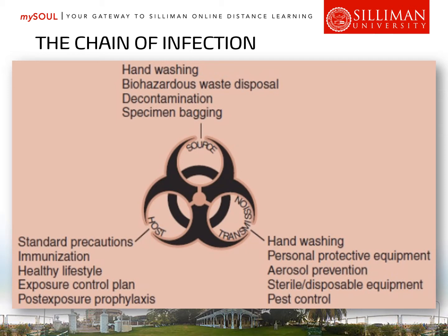The person must be in complete PPE, especially if he or she is processing specimens inside the lab, performing practices that do not lead to aerosol formation, using sterile or disposable equipment, and a pest control plan, since diseases can also be transmitted through vectors like mosquitoes, flies, ticks, and other pests.